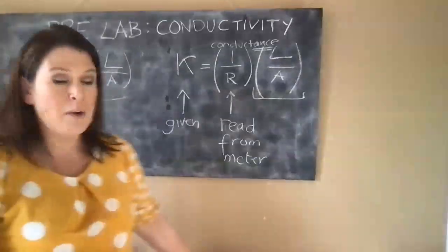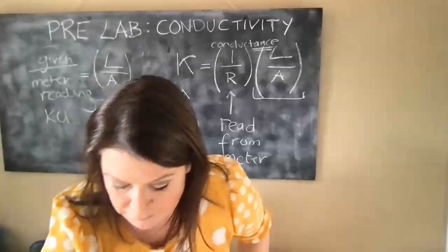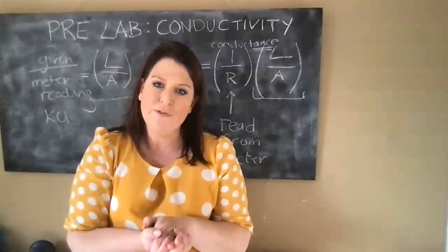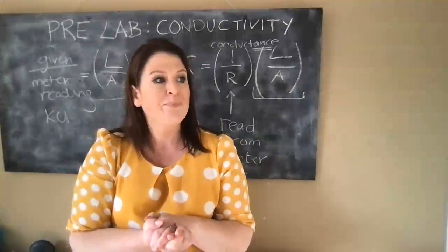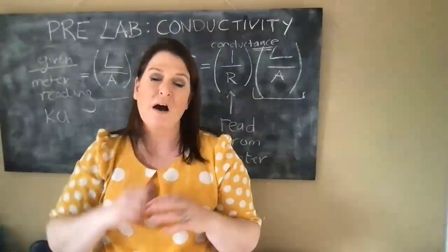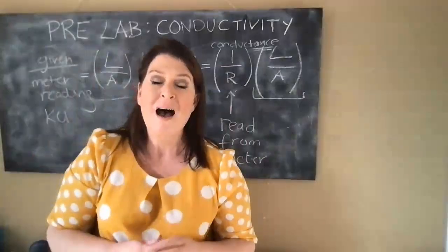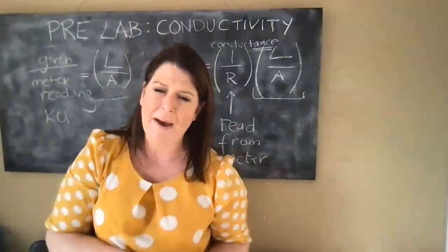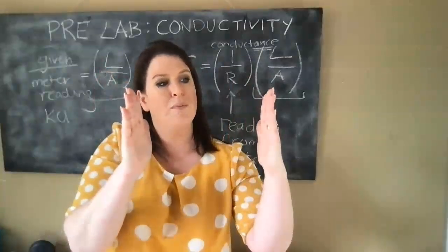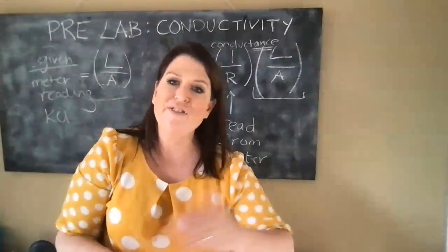One last point that I want to point out is that when we are comparing and contrasting the different solutions, you will notice that all of them are being done in a water bath. For every solution, the conductance is being taken at 25 degrees. That's a pretty simple concept, because if we want the ions to move from one part of the probe to another part of the probe, the more energy we give them, the easier that is to happen.